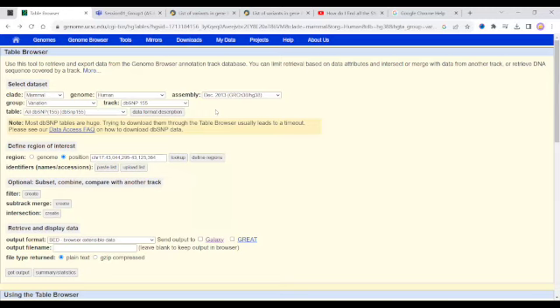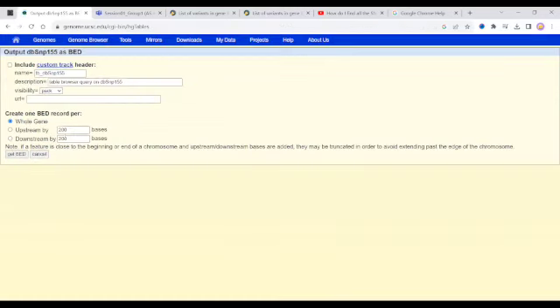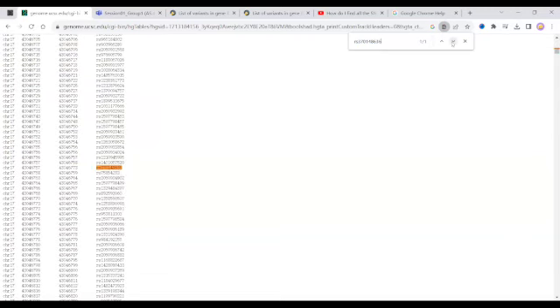Any question or comment? Another question is, what is the get output? Pardon? Get output. Yeah. And actually, in this data, they are not all SNPs, because this, I guess, is a deletion or insertion. So is the answer really correct, because there are non-SNPs here? Yeah, that's correct. To make it more accurate, an SNP should be a one base pair difference.